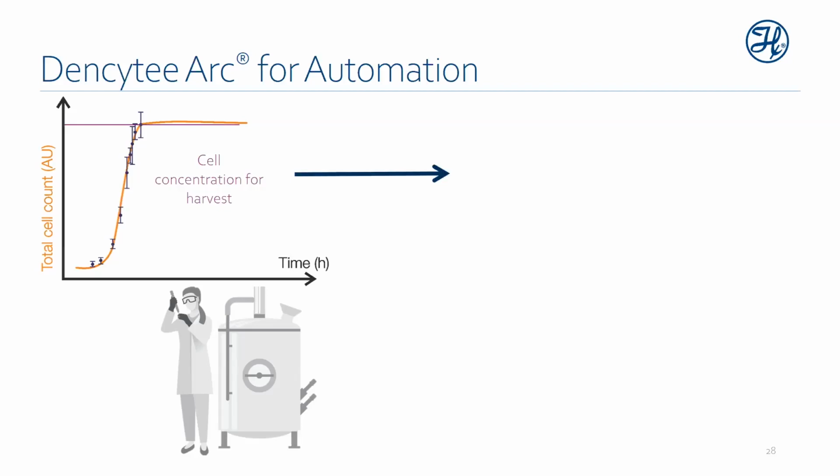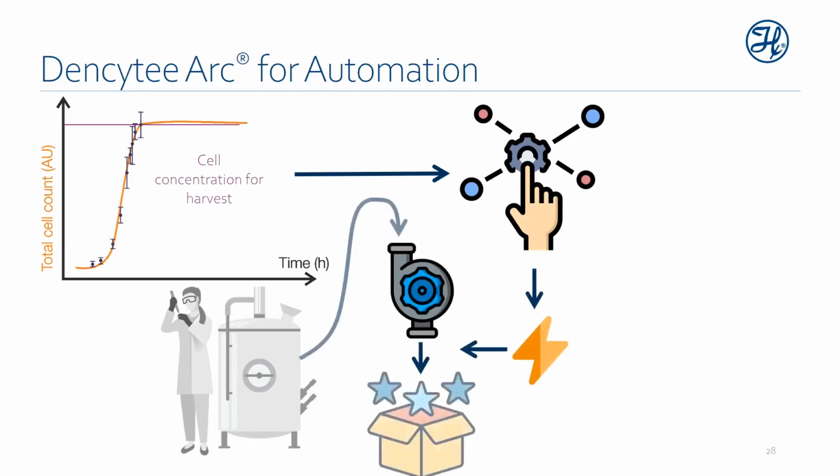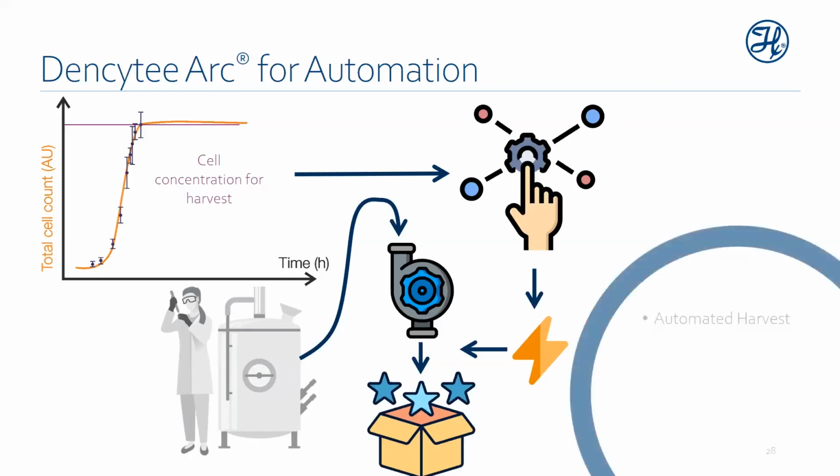An example here would be you can automate the target TCD required for harvesting and then perform the actual harvest action, or perform, say, a bleed system in order to remove a certain product. And so it's not just for harvesting. You can automate induction as we pointed out earlier, and you can automate feed control, or even bleed control, thinking more in a turbidostat configuration for fermentation profiles.